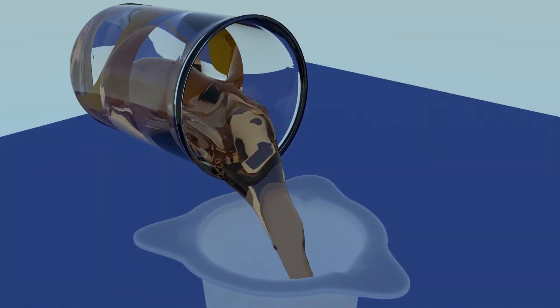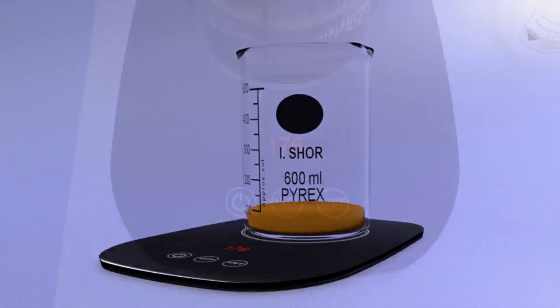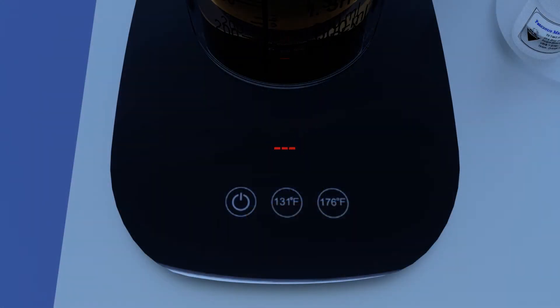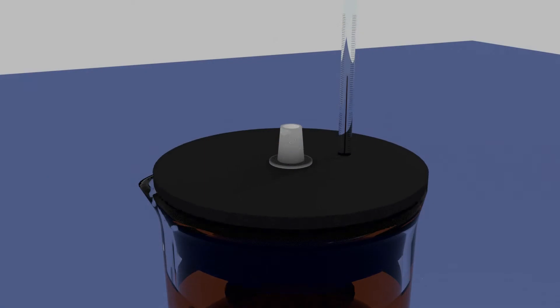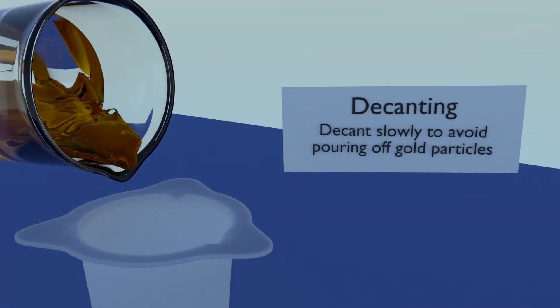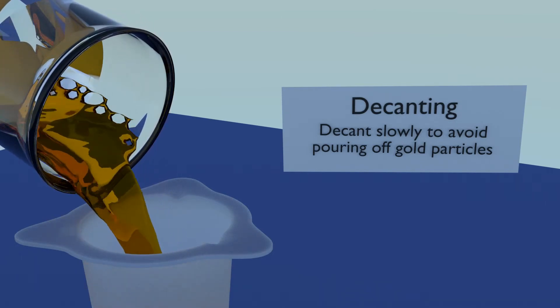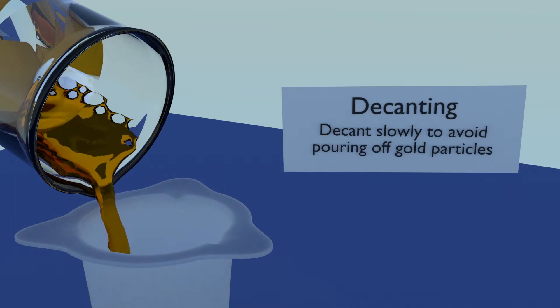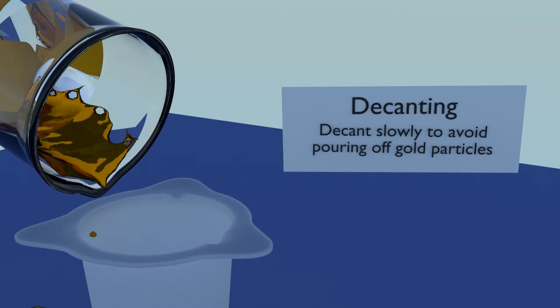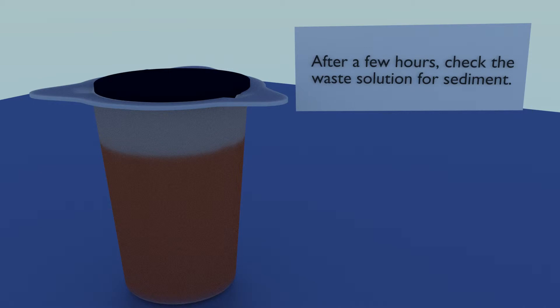Now that all the gold has precipitated, it's time to decant the acid and recover the highly purified gold powder. Turn off the hot plate and bring the beaker outdoors or to a well-ventilated area, and then remove the cap. Decant the solution into the dry pour beaker or any other plastic or glass container, being careful not to pour off particles of gold with the solution. If you used the recommended chemical ratios, then the particles should be quite heavy and remain in the bottom of the beaker while you pour off the solution. But just to be certain, we will save that solution for a little while just to see if any particles settle out.